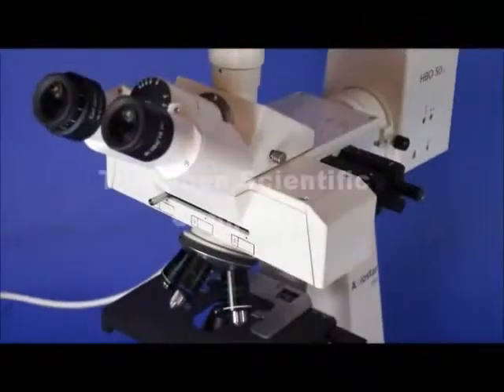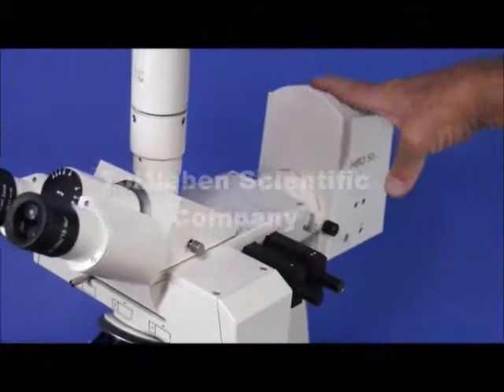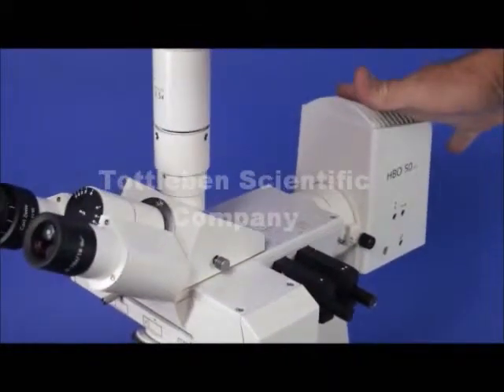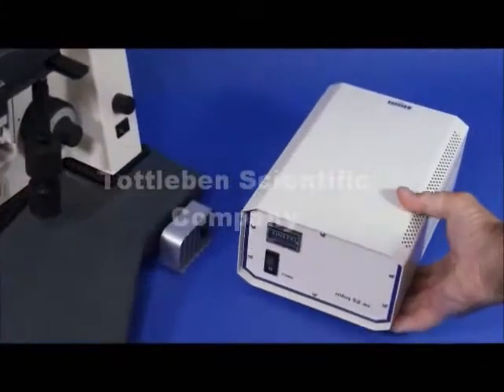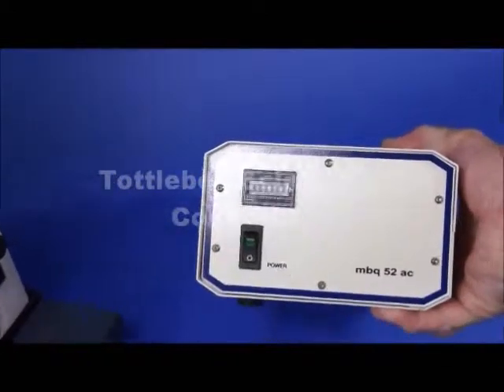This is a Zeiss Axiostar Plus microscope. It's outfitted with a mercury 50 watt illuminator for epifluorescence and it comes equipped with a new bulb, and the transformer has seven hours on it. So what you're looking at here is basically a new microscope that's only been used for seven hours.